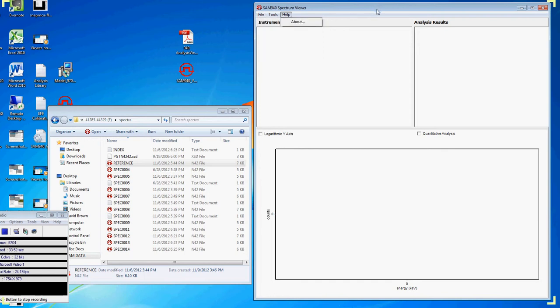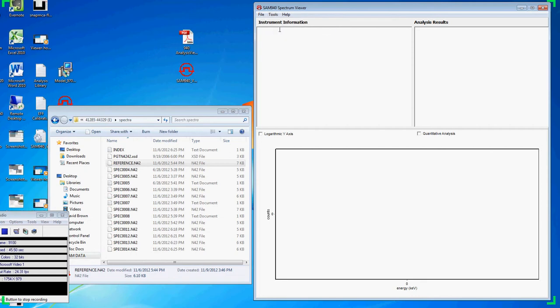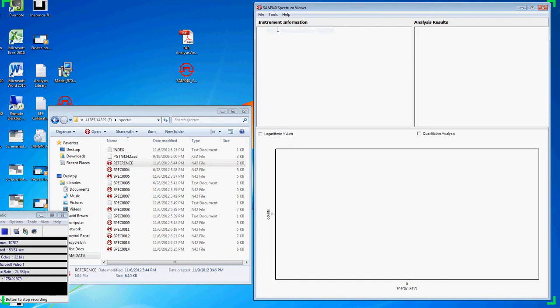A useful tool once you've installed Viewer on your PC is to associate N42 files with Viewer. This will enable your computer to launch Viewer any time you double click on an N42 file. Note the icon of the N42 files changes in real time.